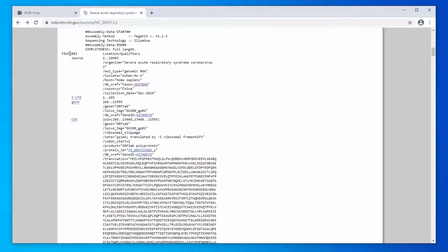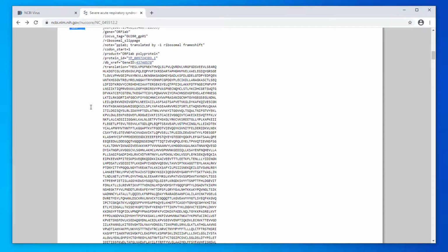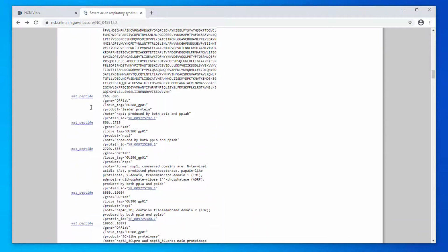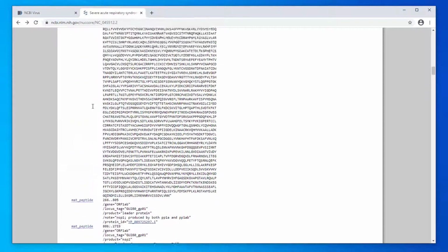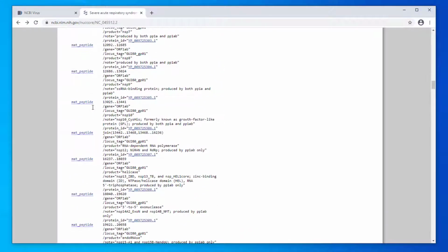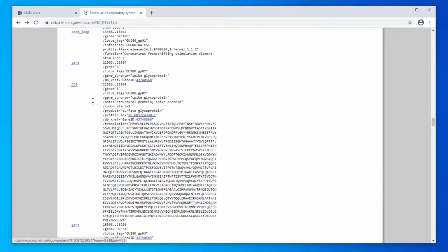And right here is where features and sources start. So you got your 5' UTR gene. Between the first position of the file and the next 265 positions, that's going to be your 5' UTR gene. Then you have your coding sequence, and basically an open reading frame. They say that all coding sequences are open reading frames, but not all open reading frames are coding sequences. And then you have your peptide. Let's see, we're looking for gene. Gene, those are the fun ones.